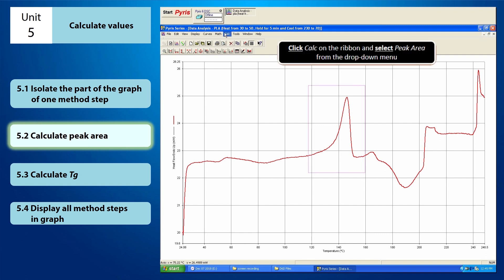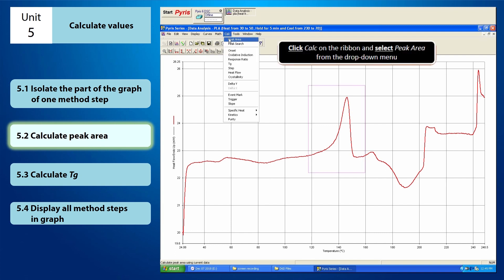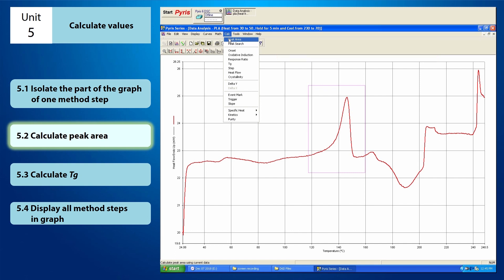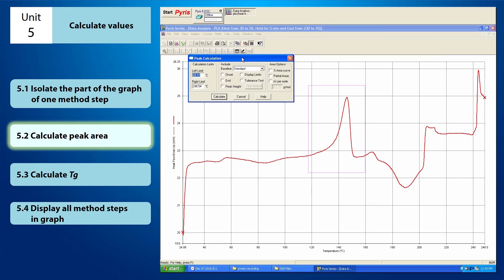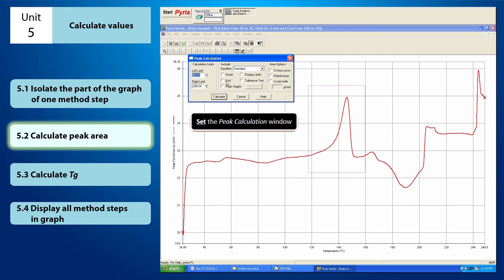First, click Calc on the ribbon and select Peak Area from the drop-down menu. Once you have clicked Peak Area, the peak calculation window will appear. From here, you have to set up the peak calculation window.